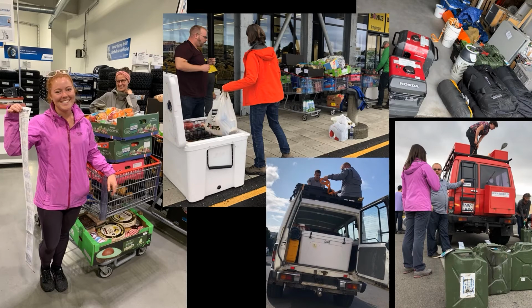Okay, so this slide just shows some images of the preparation required to get ready to go out to this remote field site and do these geochemistry analyses. So it's very remote. So there's a lot of preparation required to make sure you have everything you'll need. You need to bring everything you need with you. And we camp out there relatively near the field site. So you can see here, we have our generators, we have to bring extra gas, and we have to bring all the food we need for the whole group. And you can see it's quite a bit.